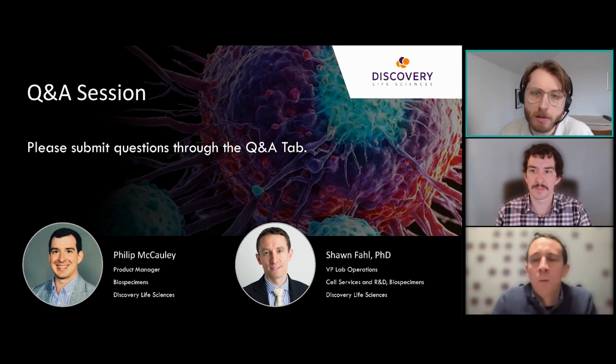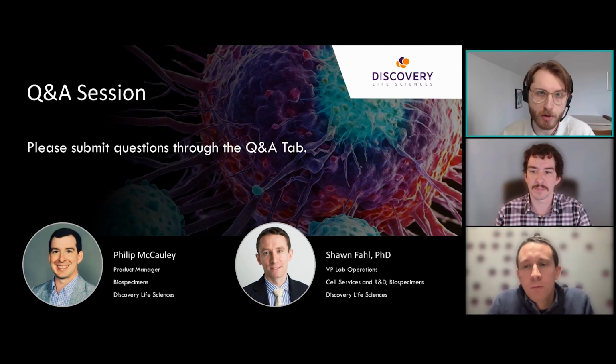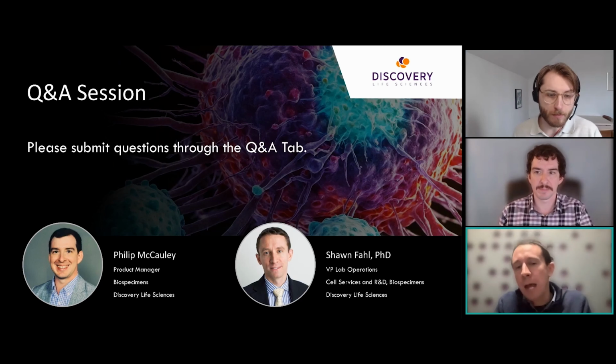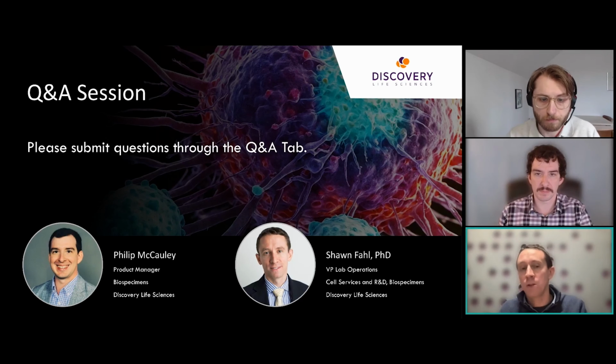Have you evaluated the ability to genetically manipulate tumoroid models? Yeah, I could take that one. That is a great question. That's really one of our future directions after we get more of these lines established. We are looking at this in two formats. One of the benefits of the IncuCyte system is its ability to read fluorescent proteins. So we are working to have our tumoroids have GFP, have some of the nuclear red viruses that can be used, so they're a little easier to evaluate under the IncuCyte system.